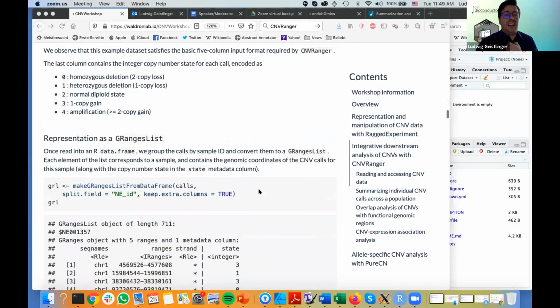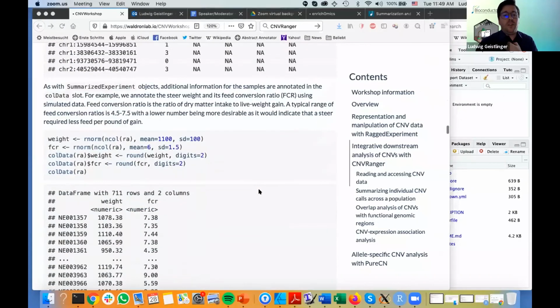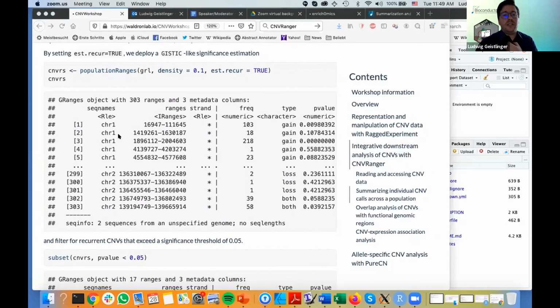As I understand the problem, on the one hand I would have the summarized CNV regions as one genomic region object. On the other hand, I would have a GRanges object which stores my SNPs, again with a genomic location.